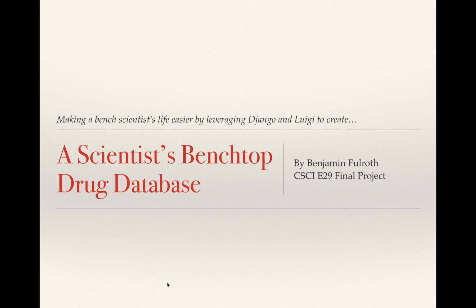All right, good evening. My name is Ben Fulroth, and the title of my final project is making a bench scientist's life easier by leveraging Django and Luigi to create a scientist's benchtop drug database.